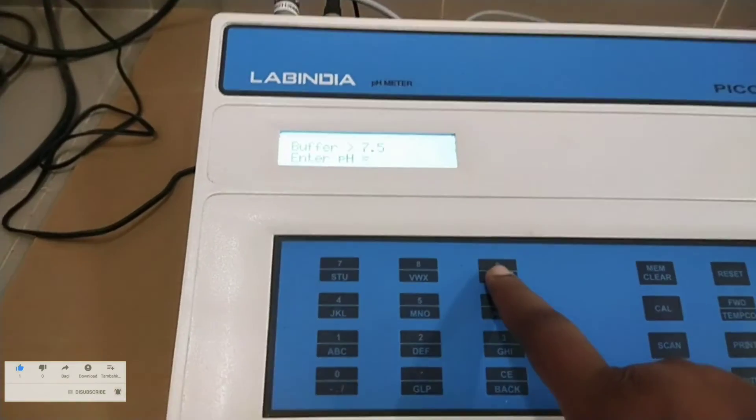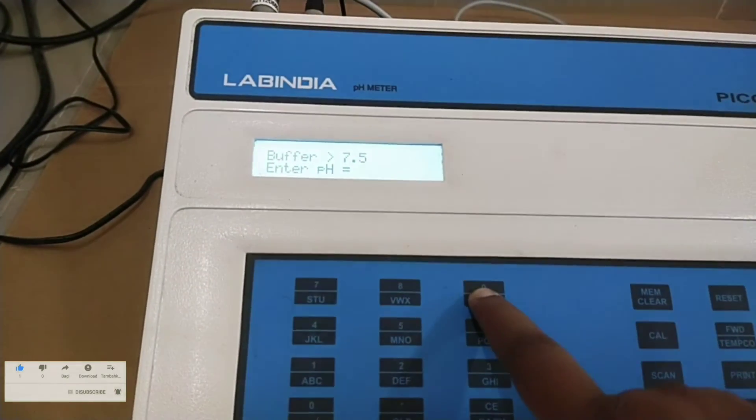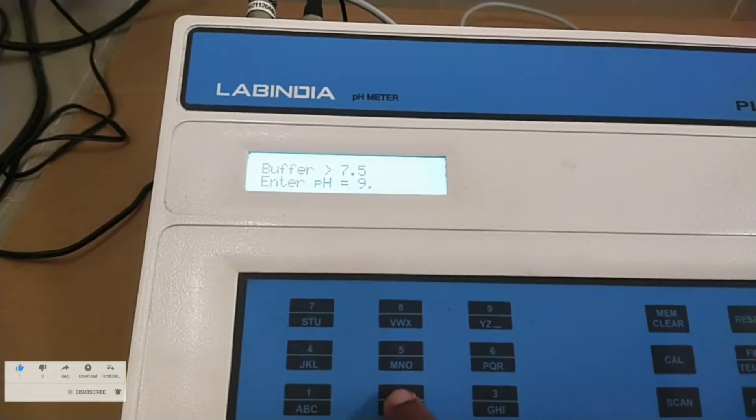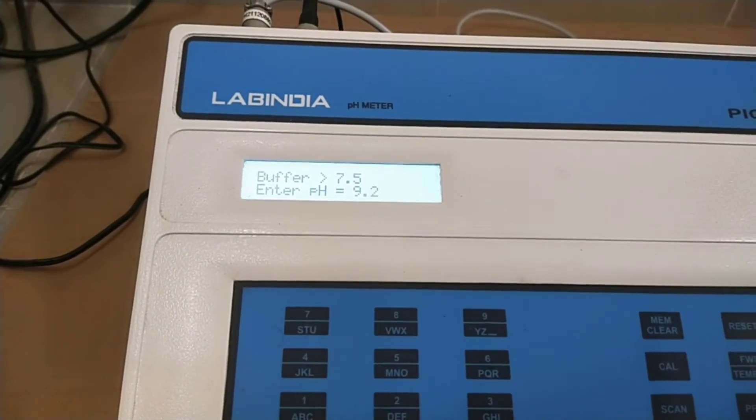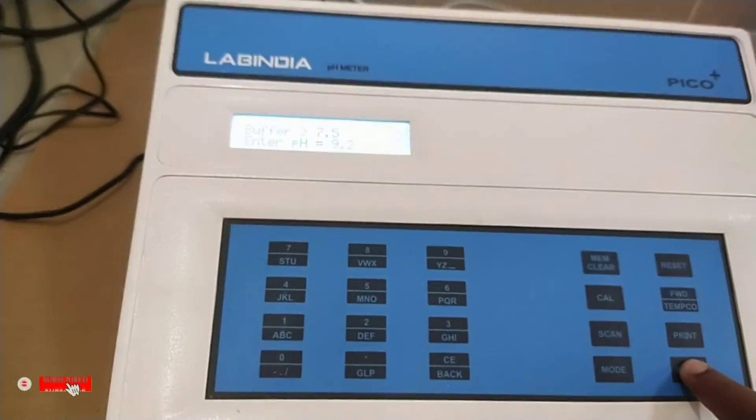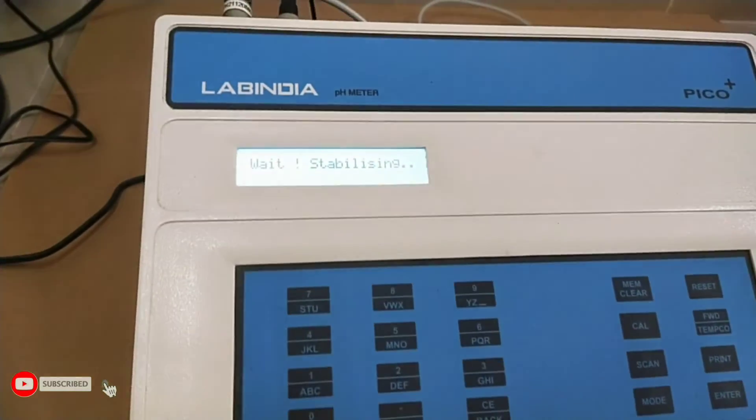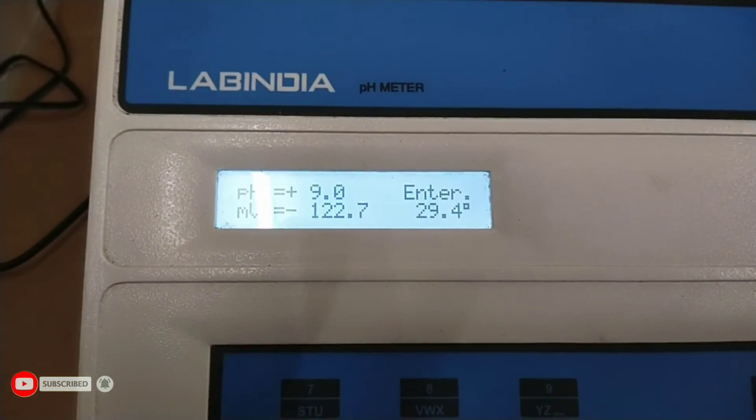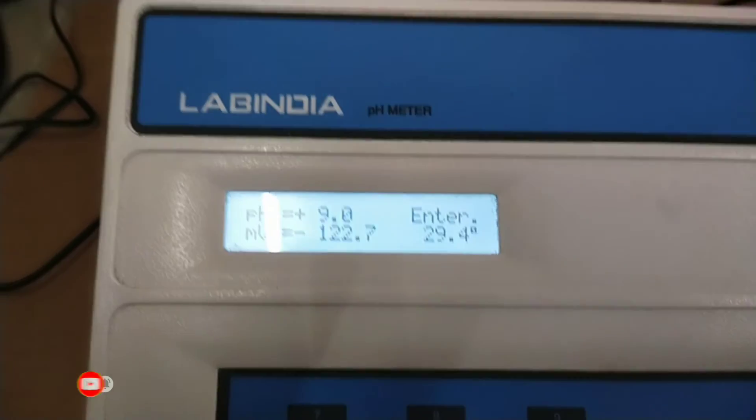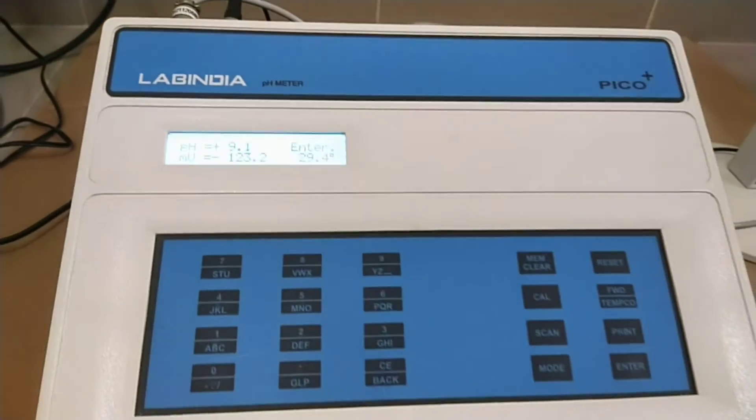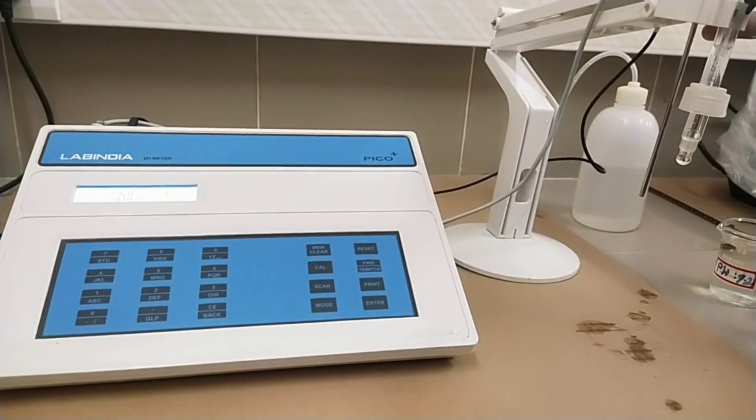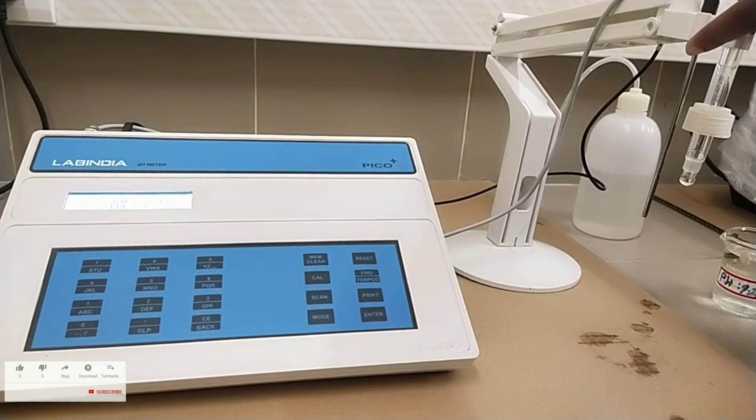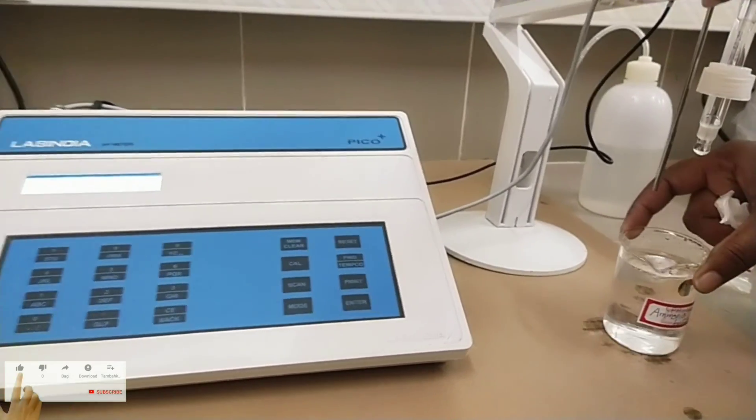Enter the pH basic buffer value 9.2. Now press enter key. It display the reading. Now instrument display calibration over. Now the instrument is ready for pH measurement of a sample.